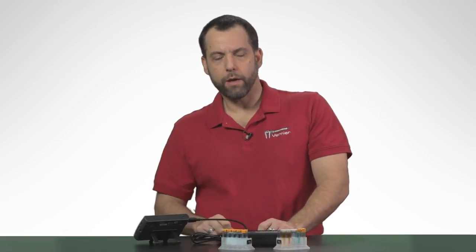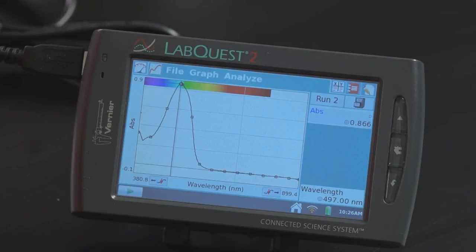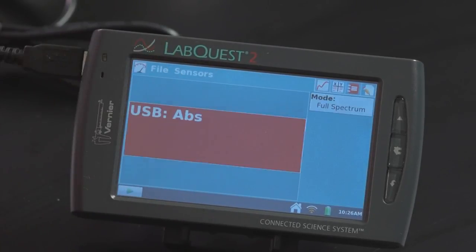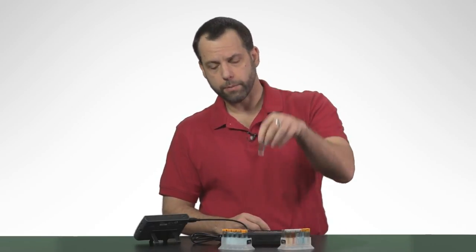Let me show you one other activity. This is the reason why this spectrometer is actually one of my favorite tools — there's an activity that most biologists do called looking at the action spectra of chlorophyll. This lab is done at colleges and high schools, and instead of taking 45 minutes, you'll see that this takes about two minutes. I'm going to go back to the meter screen, select File, New. The chlorophyll extraction I've done used some spinach, and I've extracted the chlorophyll using isopropyl alcohol. So this is my blank: isopropyl alcohol.